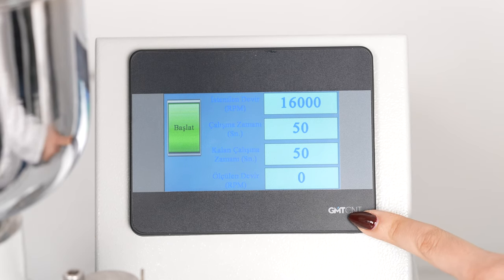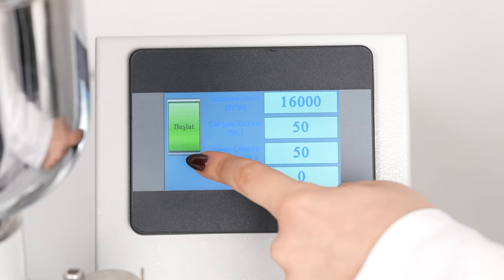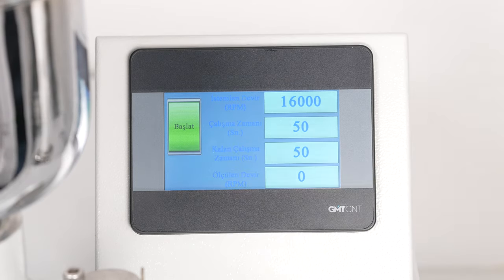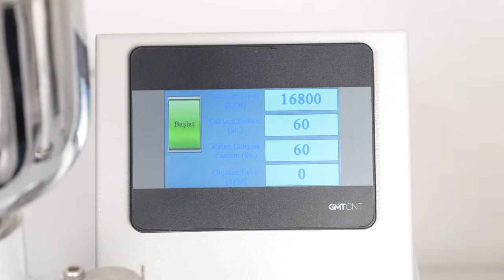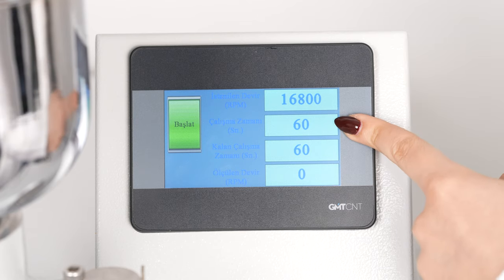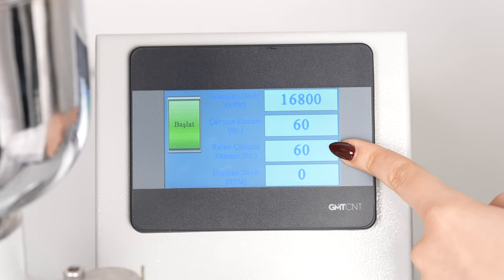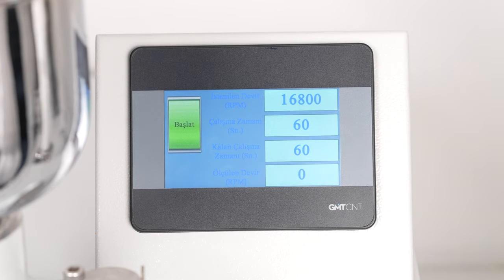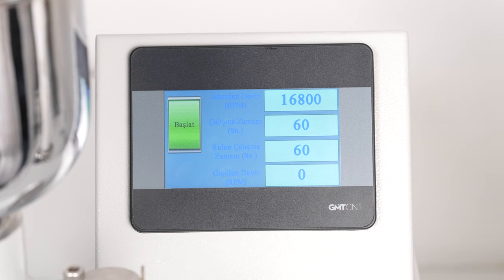The touch screen allows the grinding process to be started and stopped, the working time and speed to be set, and the process to be monitored. The Start button allows the grinding process to begin. The working revolution (RPM) and working time (in seconds) of the mill can be adjusted on the touch screen. During the grinding process, the remaining operation time and the current working speed can also be followed on the touch screen.